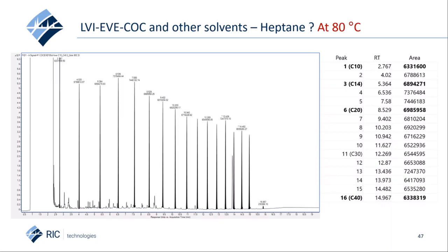In this chromatogram, where C10 to C40 hydrocarbons are separated, however, heptane was selected as a solvent to be injected, and therefore a higher vent-off temperature in the oven of 80 degrees was needed to sufficiently evaporate the solvent. Remarkably, still no discrimination was observed for C10, which proves the early vapor exit system to be a powerful tool for large volume injection.